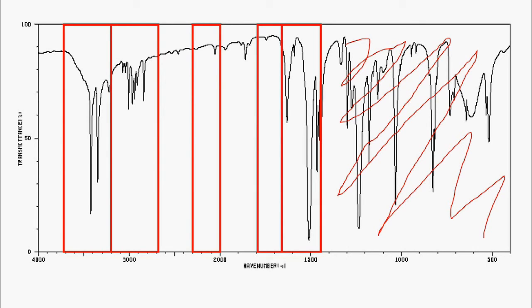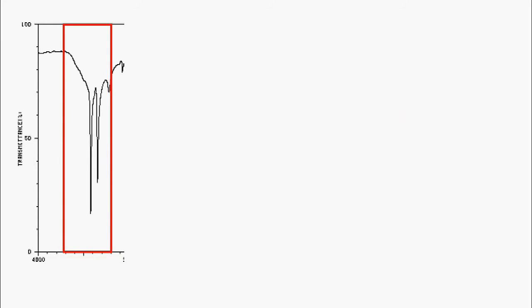So the first group has these very long spikes. With any kind of data on interpreting IR, there's a million different trends that clue you in onto it. But this one indicates the presence of some kind of amine group. So we're likely going to have some kind of amino, either with hydrogen or, I believe, the possibility of a secondary hydrogen present.